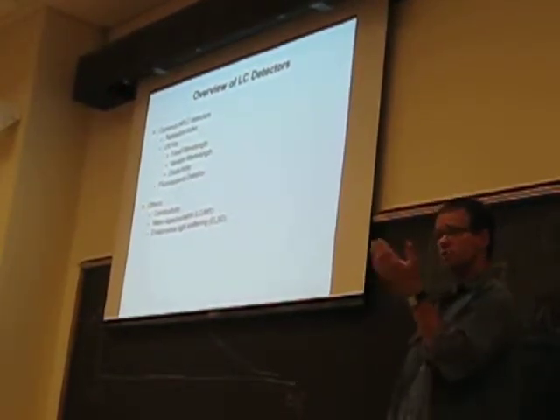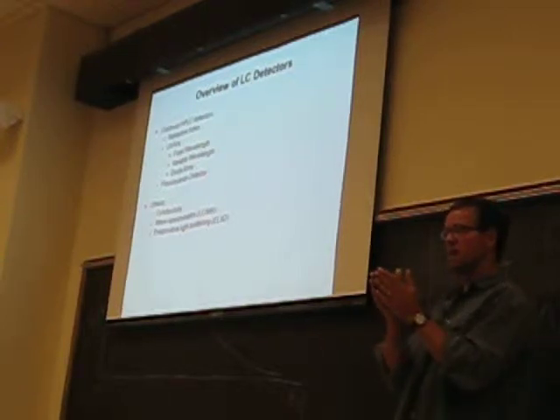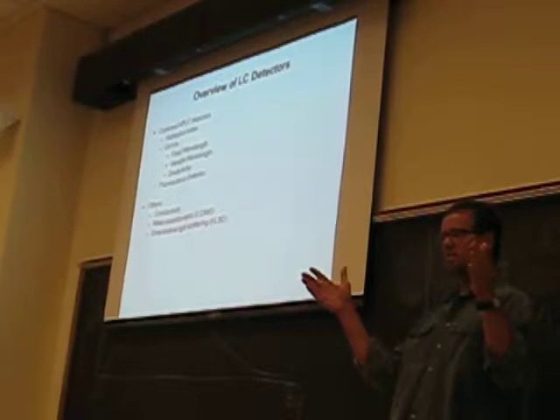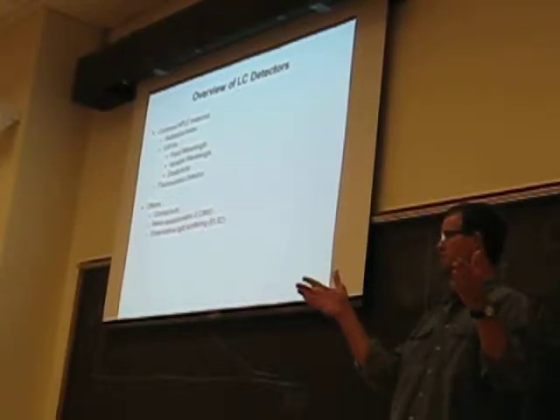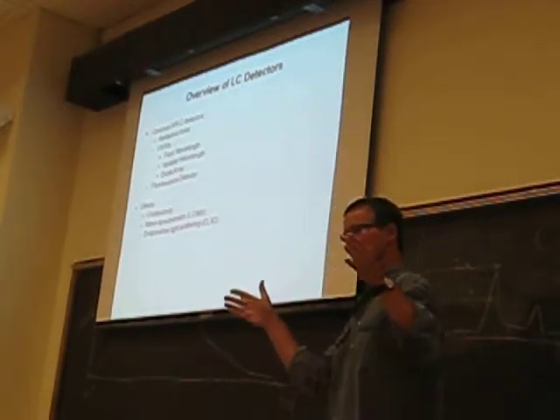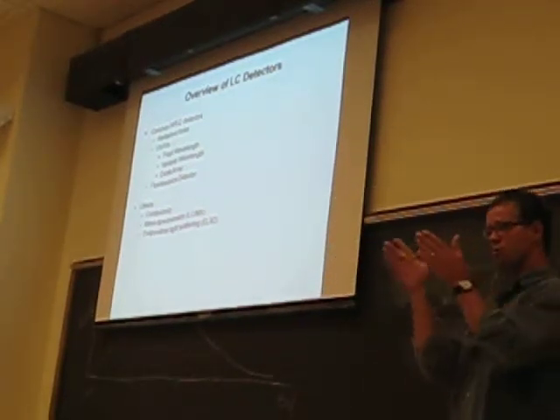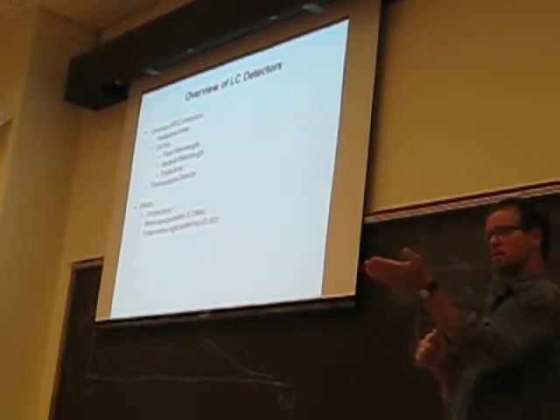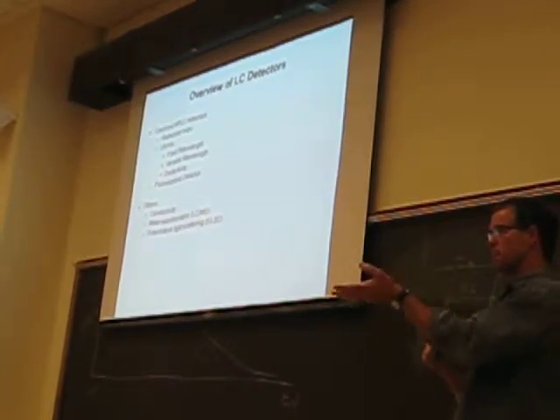And that deuterium arc lamp generated a broad wavelength band of ultraviolet light, electromagnetic radiation that spanned a whole range of wavelengths, right? And you used the monochromator to select the wavelength you want based on the absorption maximum of your complex, right?